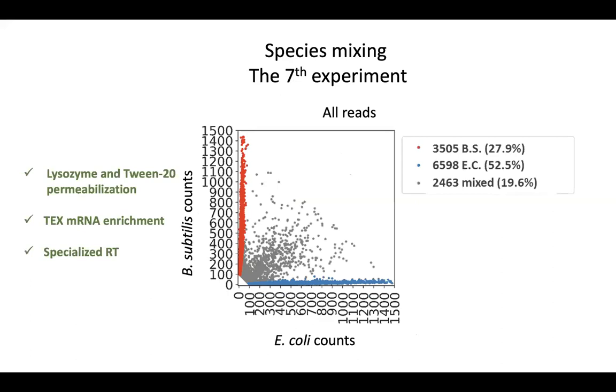By the 7th experiment, we had improved. What we've introduced here is the lysozyme treatment, so now we can break down the cell wall, and some detergent permeabilization. We've also attempted to enrich the mRNA, but I think the major part was played by the specialized RT protocol, or reverse transcription protocol.